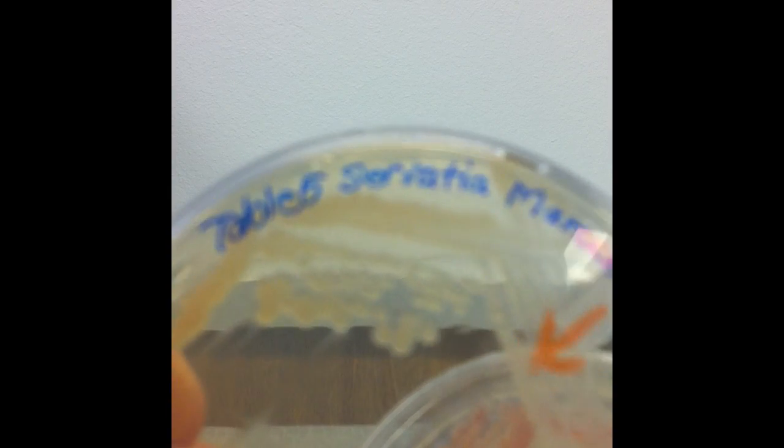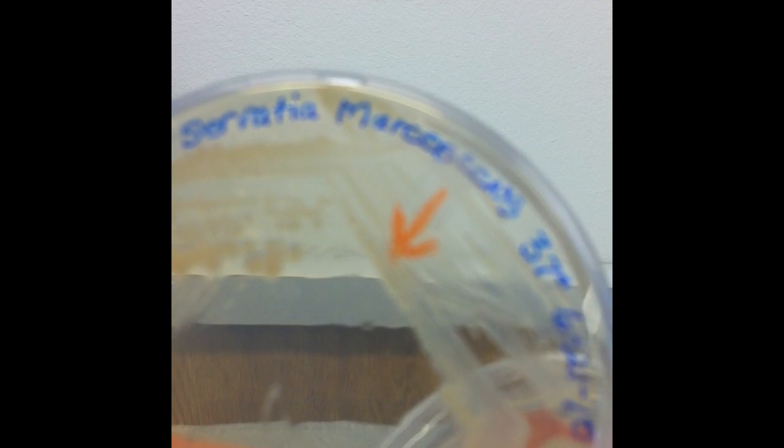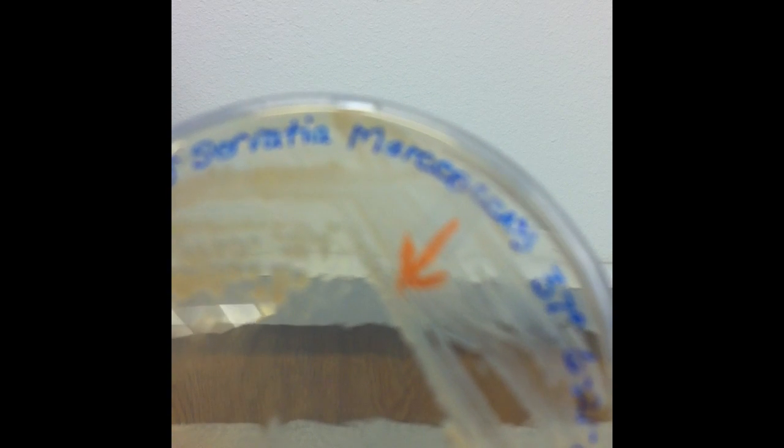If you'll notice this plate, this is also Serratia, but this one was started in the incubator and has since spent quite a few days, about 5 days, at room temperature. Even though it's been at room temperature for a long period of time and came from exactly the same starting broth as this one, it's still not making red colonies. So it's worth being aware that for Serratia to produce red colonies, it's better to start it at room temperature, not start in the incubator and then move to room temperature.